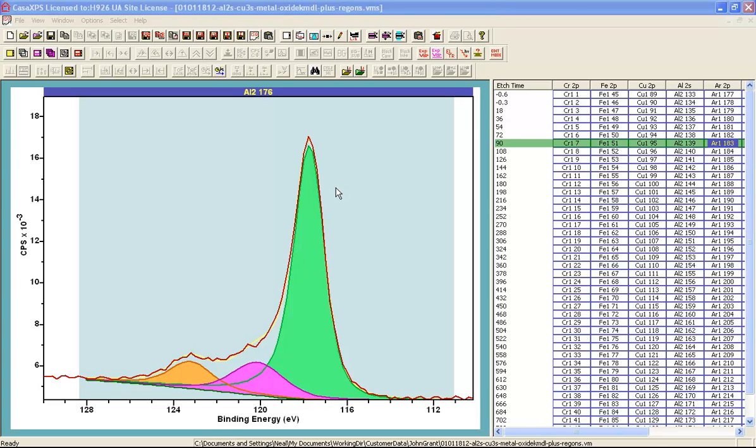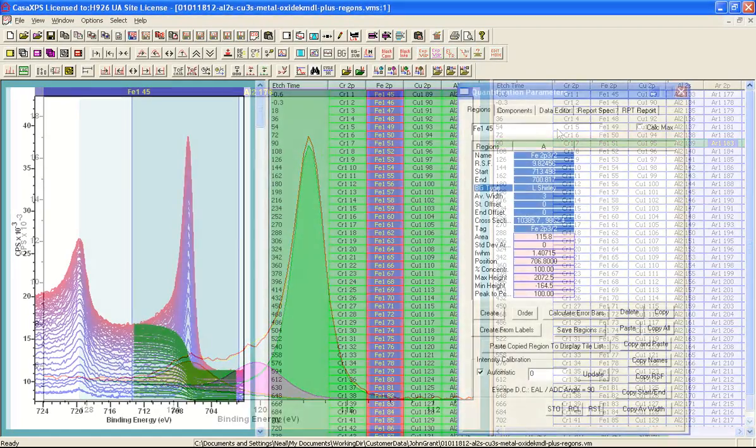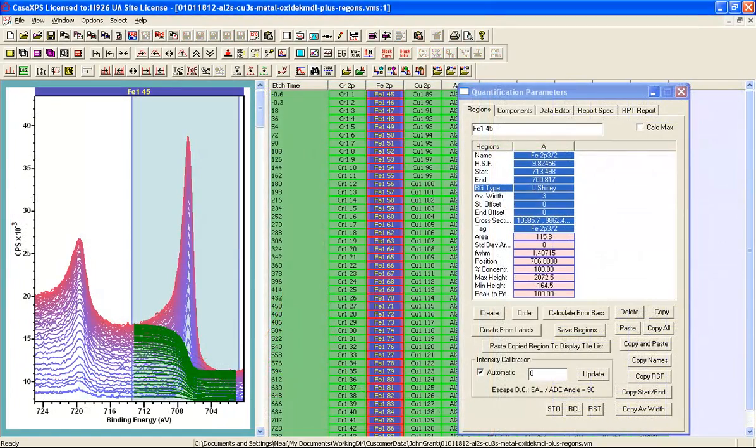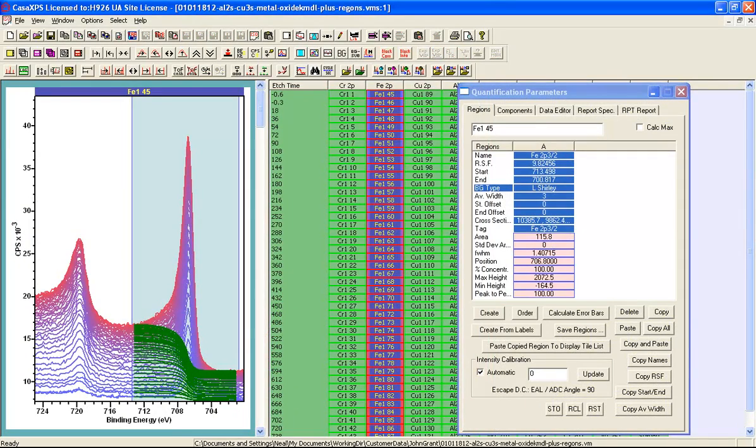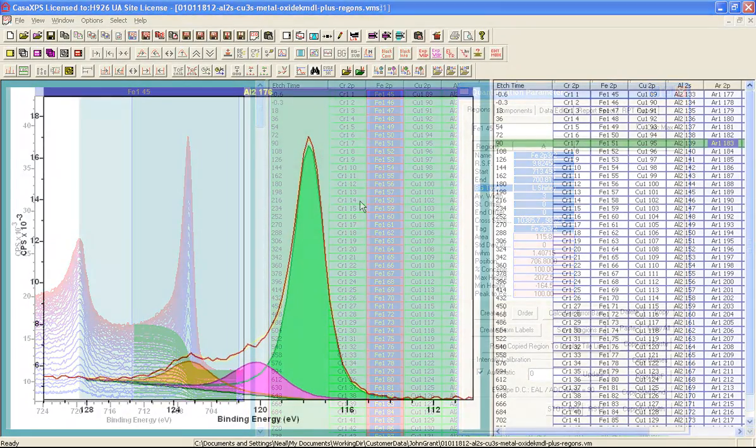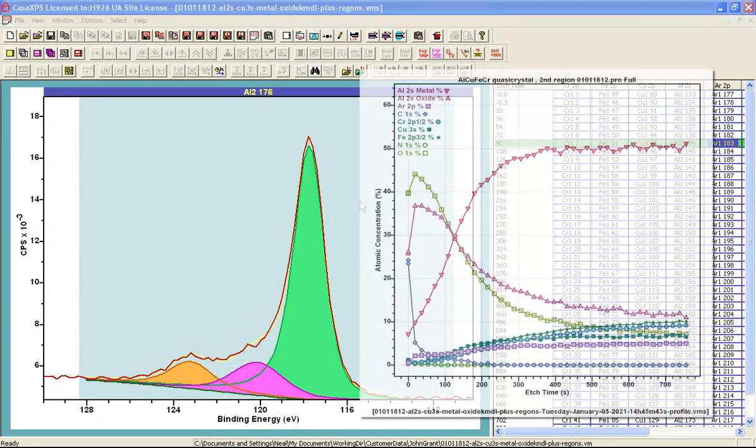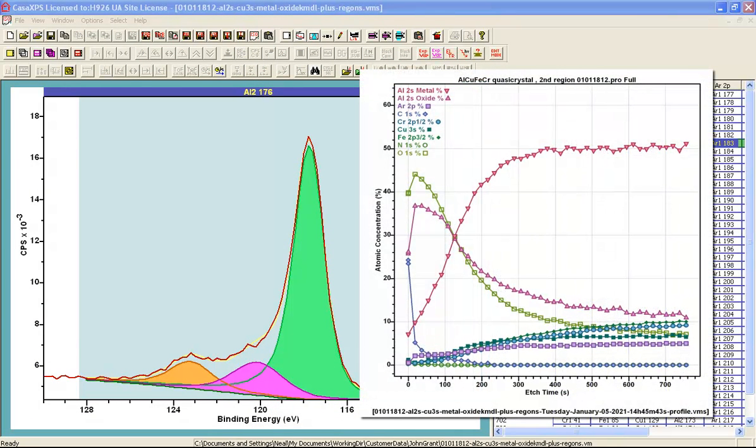In this video we are going to look at how to manage the display of depth profiles. A depth profile in XPS is created from a set of narrow scan regions or even survey spectra where regions and components can be defined. The actual profile shows how material changes as a function of depth.